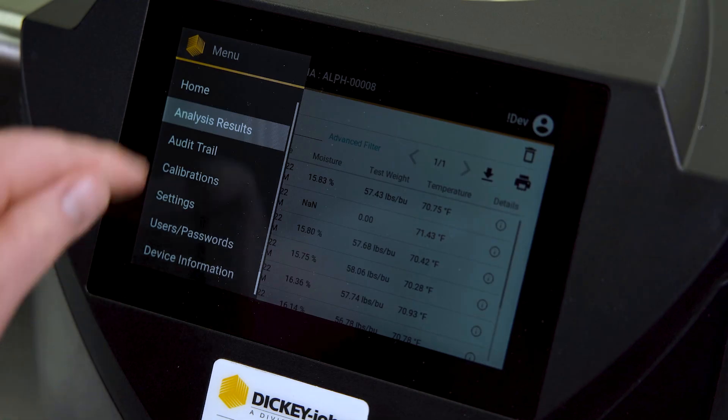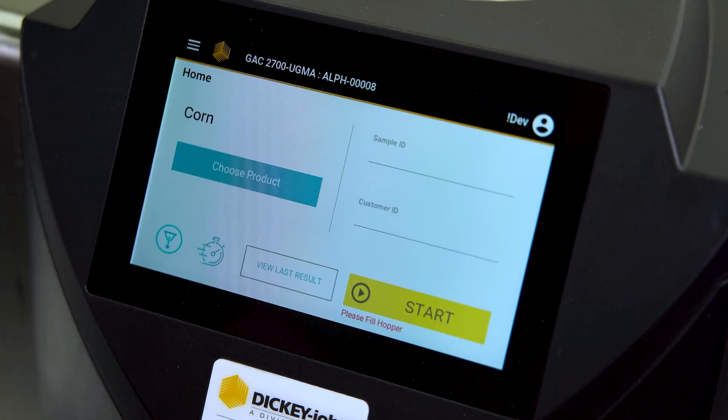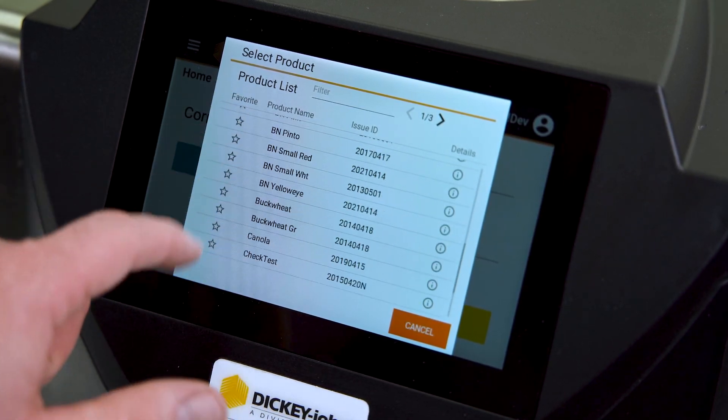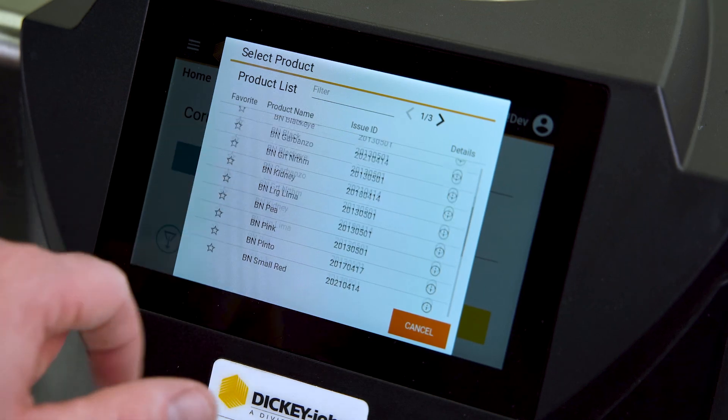The new larger touchscreen improves usability as it's now brighter and more responsive than previous instrument screens. Operators are able to see the measurement results from a greater distance and no longer need to use a screen stylus.